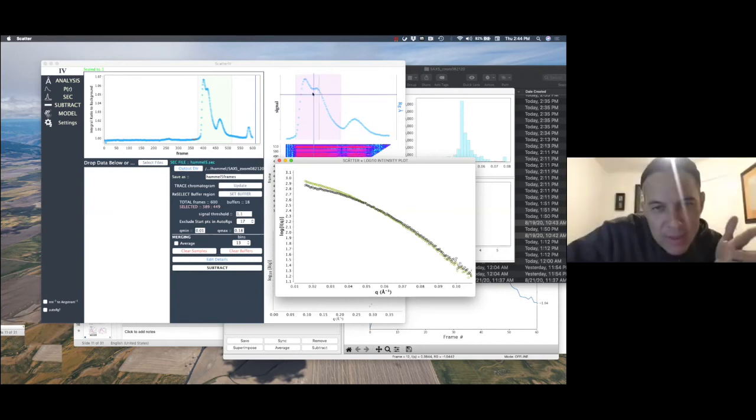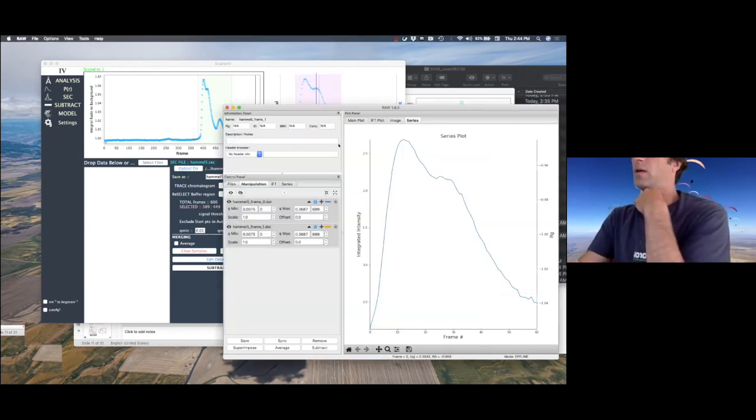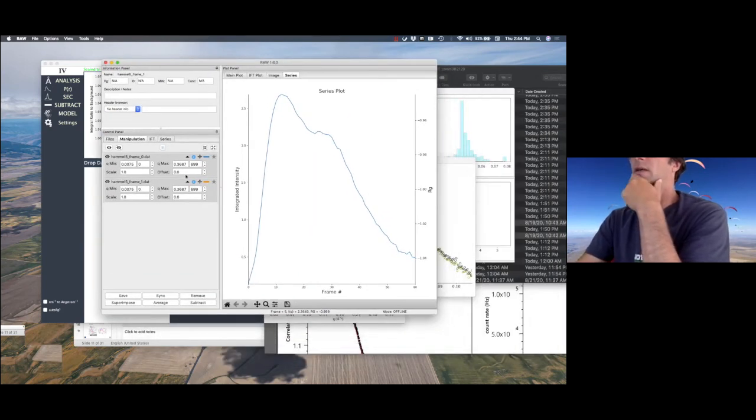Right, but wouldn't you say you have these two curves, so wouldn't every point in there now be a linear combination of those two curves? Yes, that's what I was doing in RAW, as you see here.